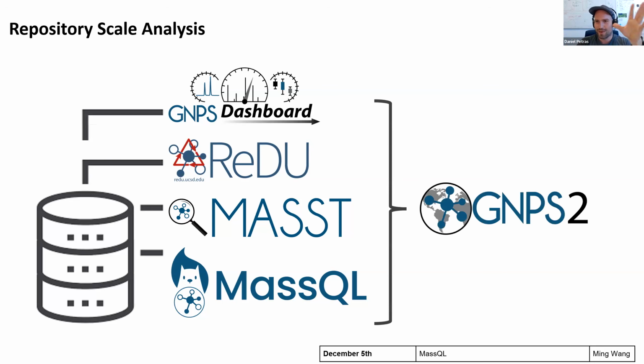And then, I think within that framework, I'm very much looking forward to next year having an entire series where we will present the new iteration of those tools within the GNPS2 platform, which has just launched, and there are already some beta versions of some of them out.